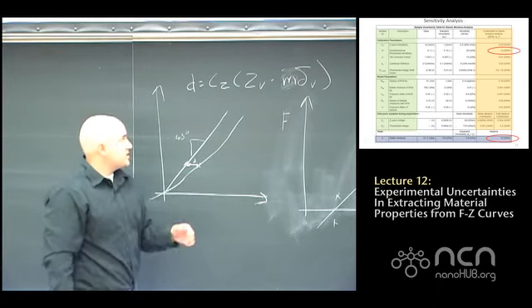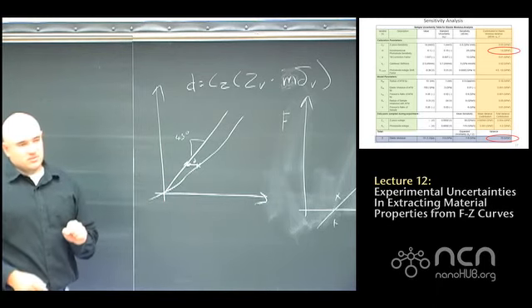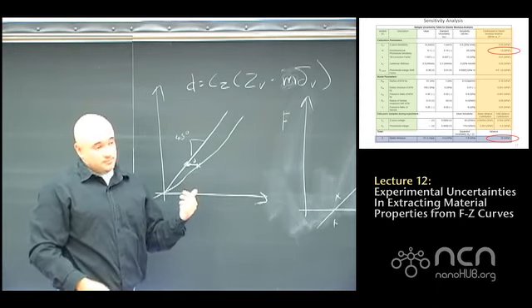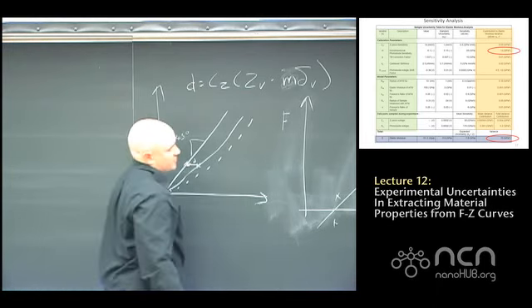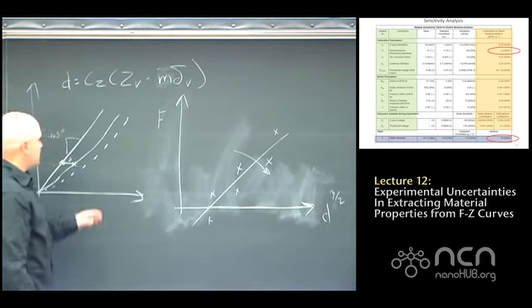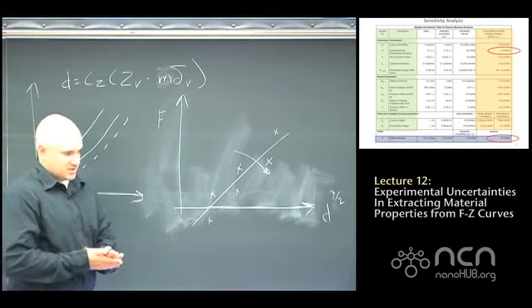And then in terms of calibration, M changes all values of delta V independently of ZV. So that causes this entire curve to shift like this, which shifts the entire slope of this curve. And if you think back, I said E was more or less proportional to the slope. So it turns out that because of the way we set up the calibration, M is the dominant contributor to uncertainty. So that's more or less the entire lecture I had planned out.